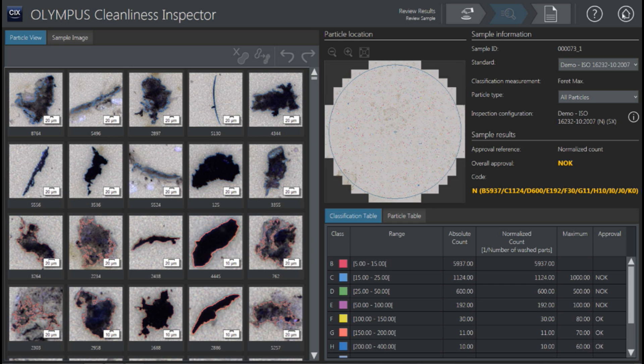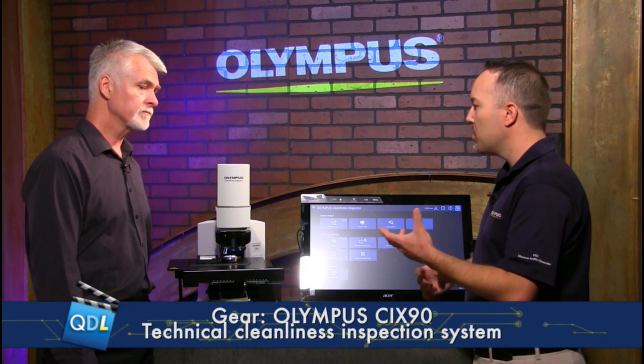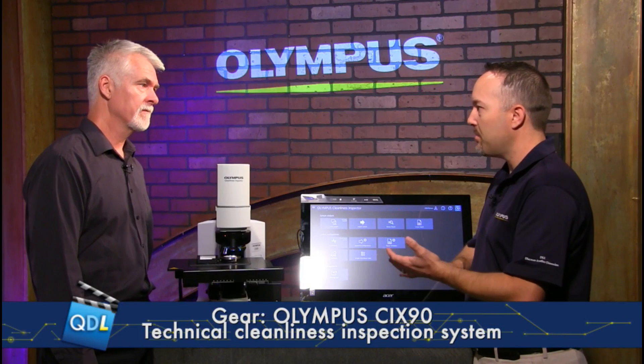That's great for traceability for the customers. That's the workflow — it's pretty simplified. This is the CIX90, and it's quite a bit faster than previous versions because you do everything in one pass. Our old filter inspector system required two sample scans: one scan for particles, and then another whole scan to do just the reflecting stuff. The user also had to interface with the hardware — sliding in a polarizer system to counteract reflecting particles, then pulling that out for the second scan. This fully automates that, takes the human element out of sliding sliders in, and does it all in one scan, so it's really twice as fast. The CIX90 Cleanliness Inspection System from Olympus. Rob, thanks once again for joining us.